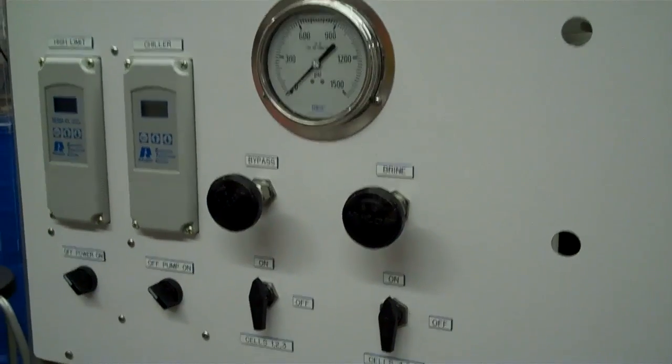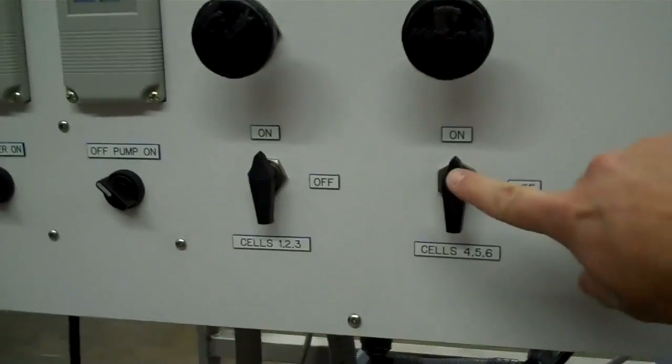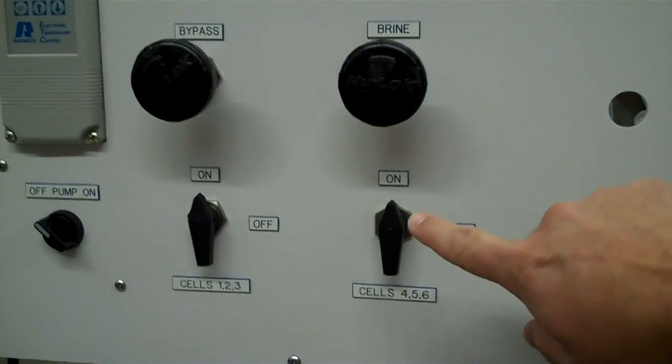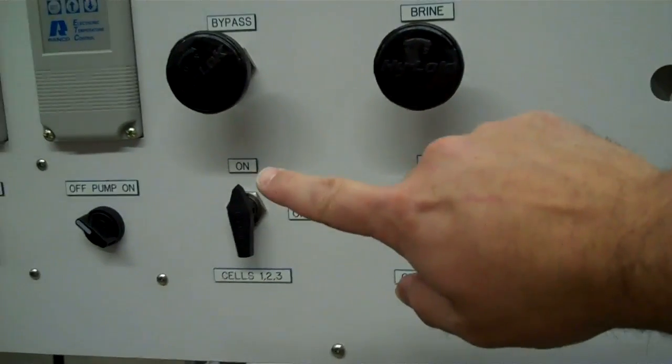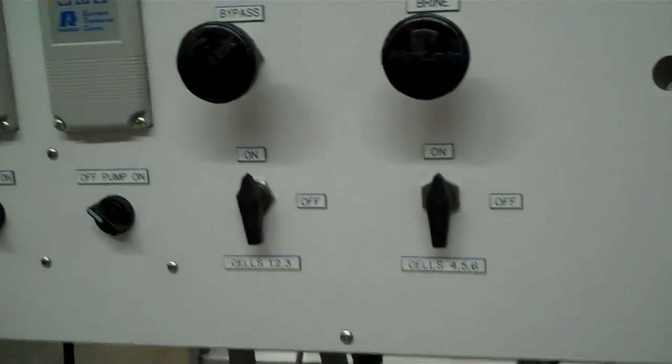You can see the knobs, one for the brine, one for the bypass. And then this area here is where you can change which set of cells you want to run. Cells one through two, three on or off. Cells four or five, six on or off.